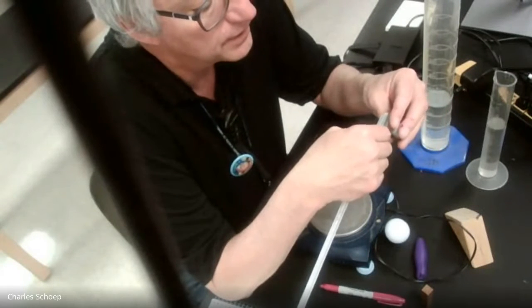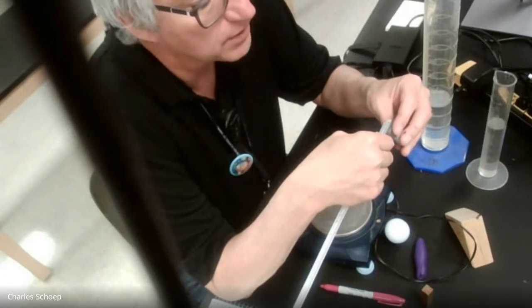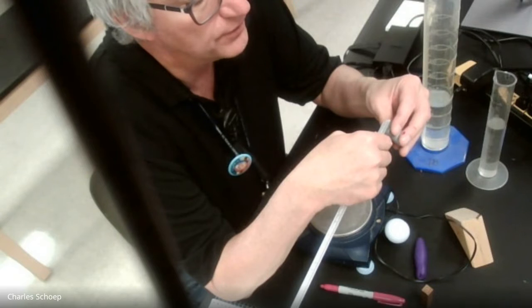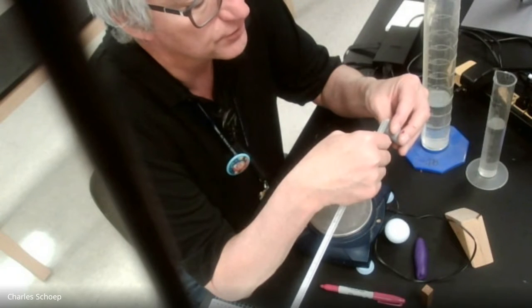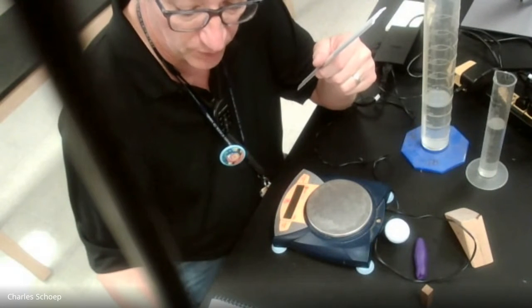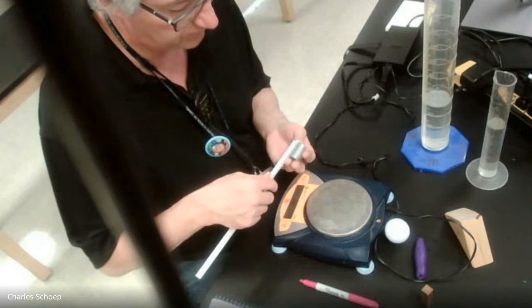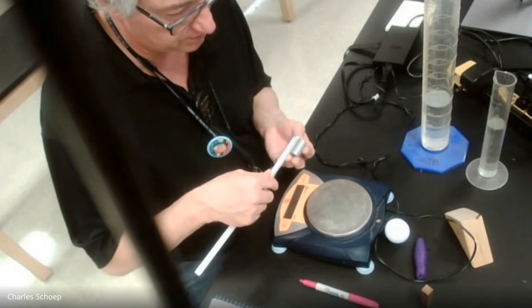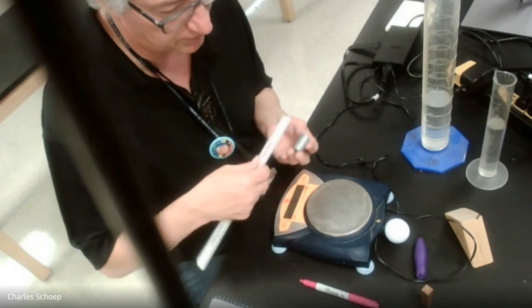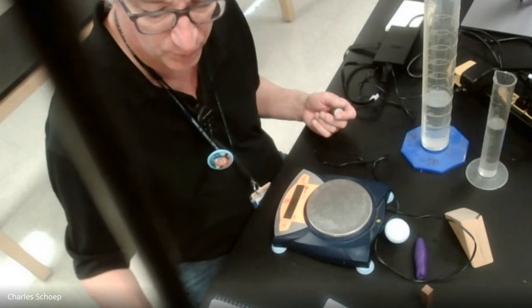All right, so the diameter all the way across is 1.8. So the diameter, which is all the way across, is 1.8, which means my radius is equal to 0.9 centimeters. My height is 3.1 centimeters.